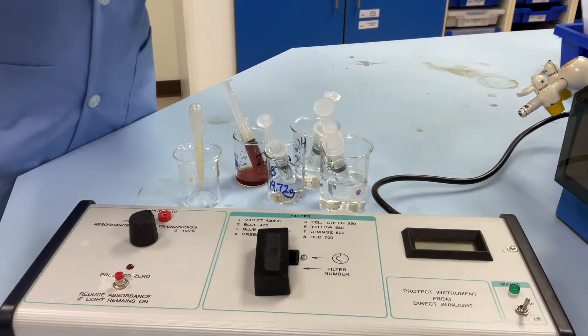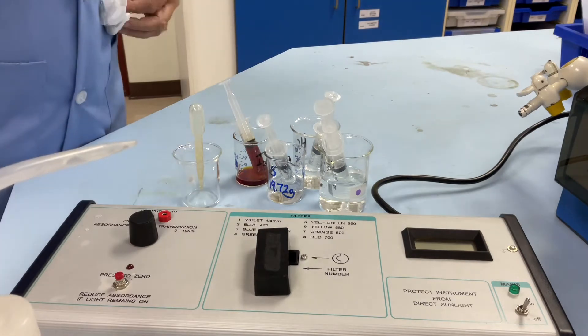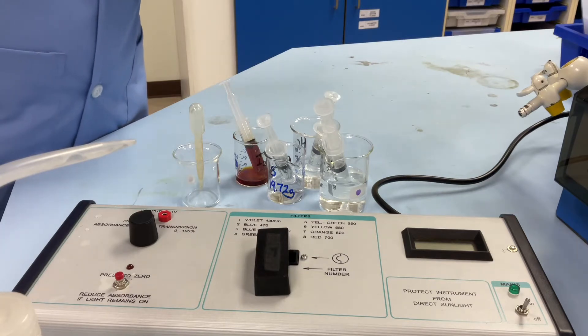I'm just going to fill my cuvette up with distilled water. You can see that it's got two sides to it — one's opaque and one's clear. And we must make sure we haven't got any fingerprints on the clear side.